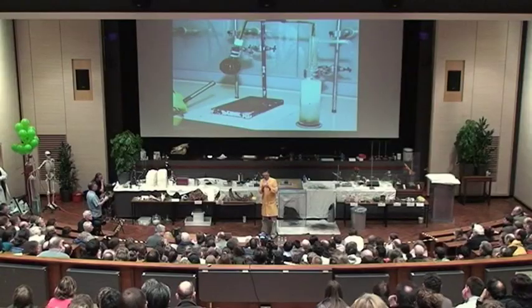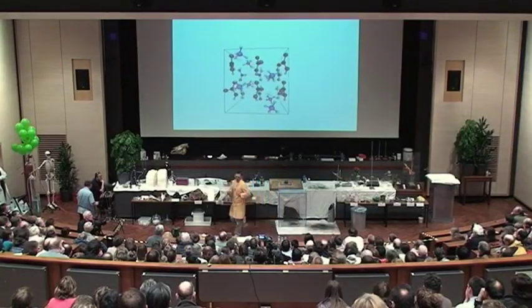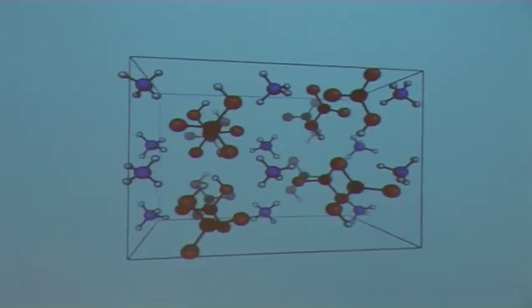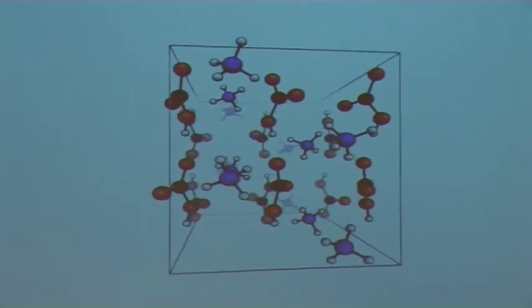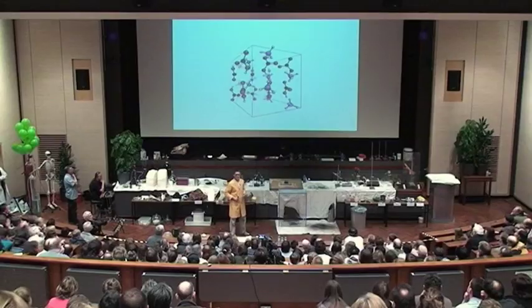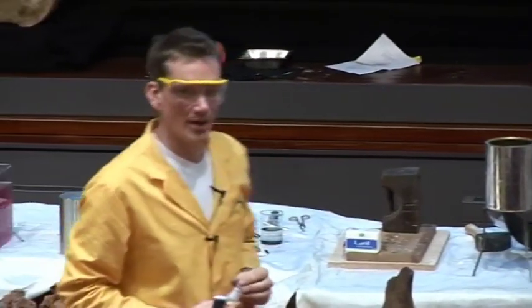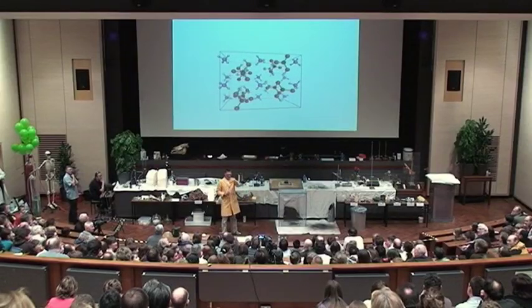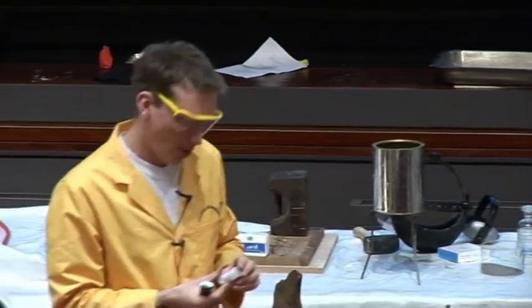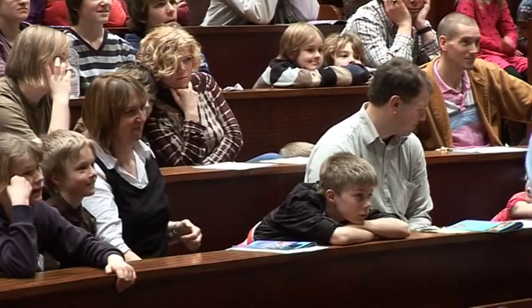We thought we had to check to make sure that the salt of hart's horn from the distillation really did contain ammonium carbonate, so we had a crystal structure determined here in the department. By shining some X-rays onto our crystals, it revealed the presence of atoms in the structure. The blue are nitrogen, surrounded by four hydrogens — that gives us our ammonium — and the black and red make up the carbonate unit. That thing whizzing round there really was from crystals that came from the distillation of the hair. Our crystallographer John, who I think is somewhere in the audience — there he is, right at the back — got very excited because he thinks it may actually be a new morphology of ammonium carbonate never seen before. If this is the case, we're going to have to publish this and describe how we made our ammonium carbonate.